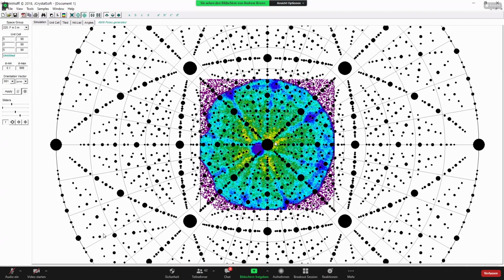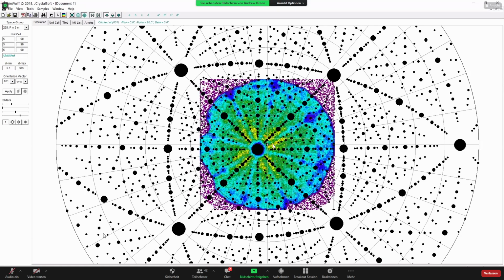We can see this nice pole right in the middle here. We've got a nice 4-fold symmetry. So I'm pretty confident that that's going to be 001 or 002, when we take into account that we're using the higher index for the smallest plane spacings along that direction. But the direction is 001.